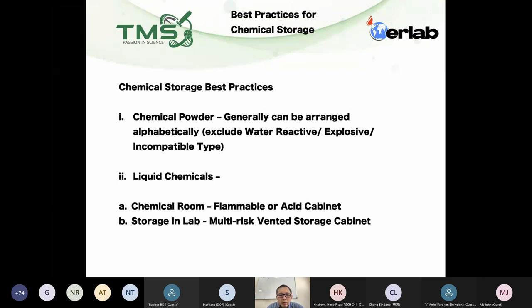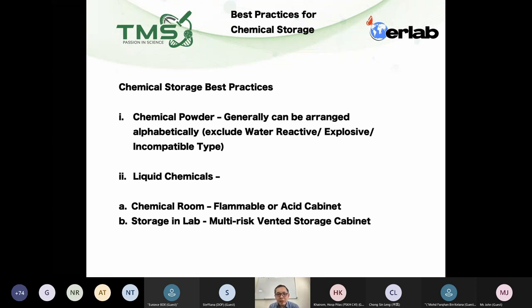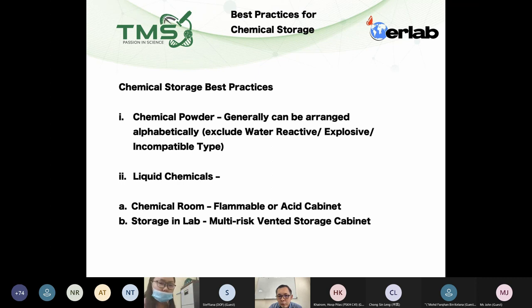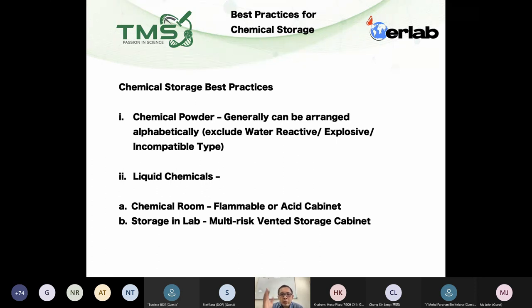Let's start with powder and liquid chemicals — we should segregate these two types. For chemical powders, you can arrange them alphabetically, A, B, C, D. Of course, you must segregate water-reactive powders, explosive powders, or those incompatible with the rest into separate cabinets. For the others, you can arrange them alphabetically on the appropriate rack or shelf.